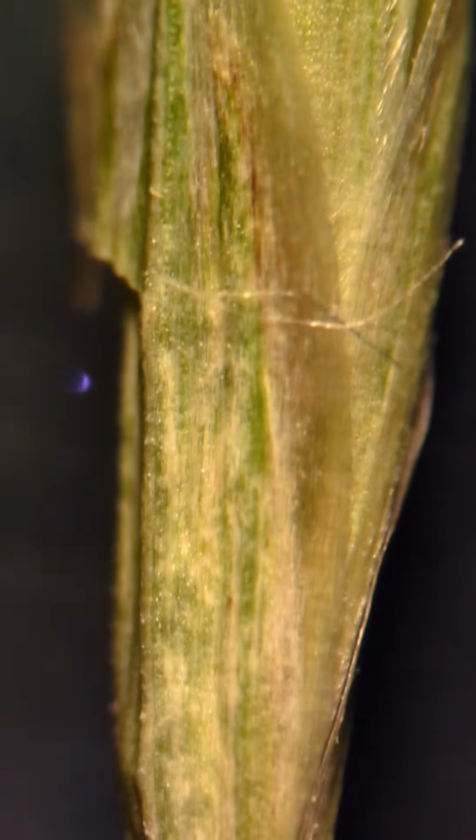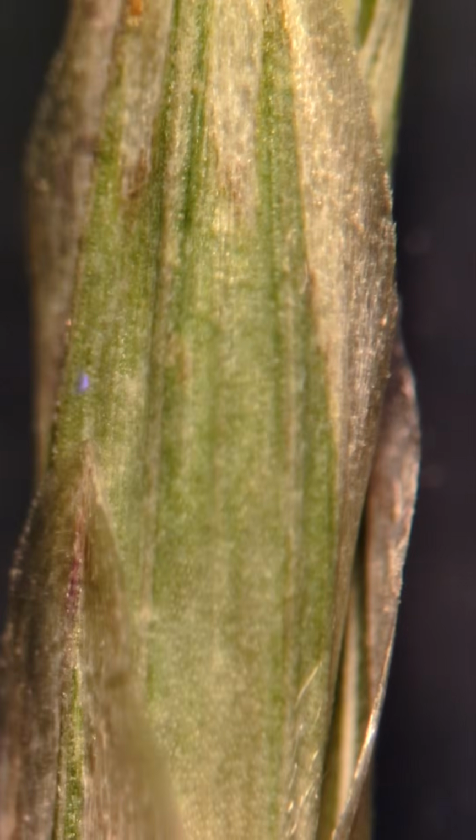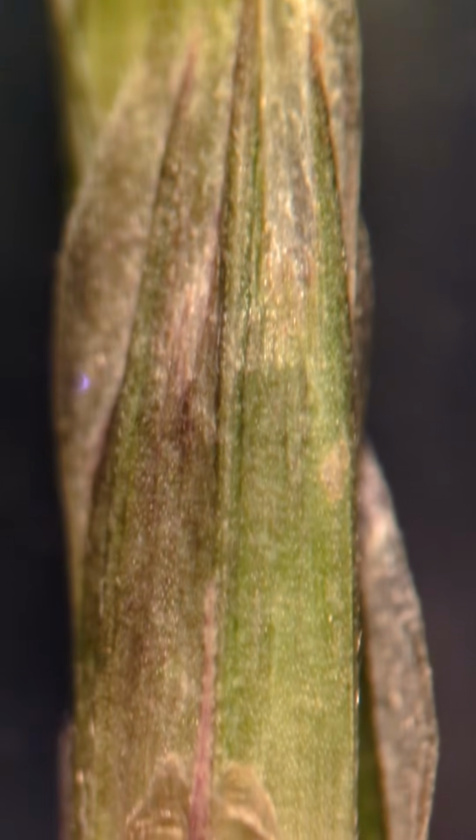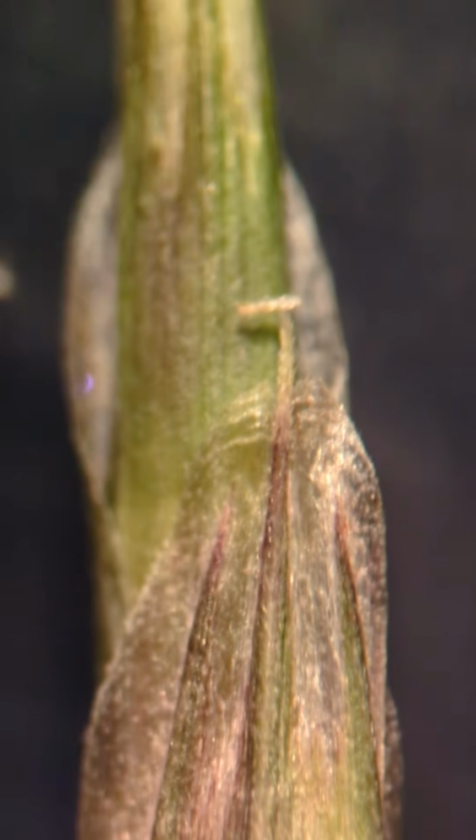There's special botanical words for things in the Poaceae family because they don't look like most other families, like awn and ligular, ligule, and some other stuff. Anyways, some of these things, it's the first time I'm seeing them under the microscope with you here, and some of them, you're in for a treat.